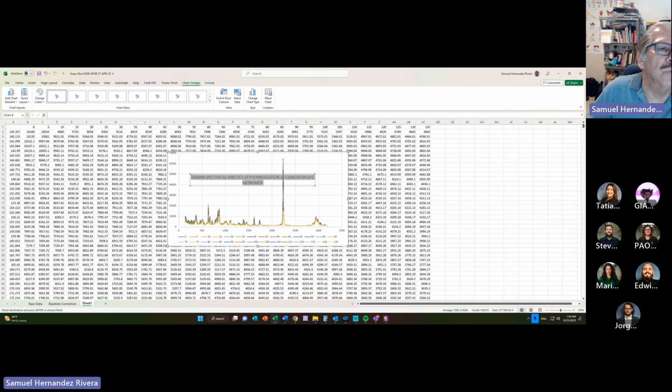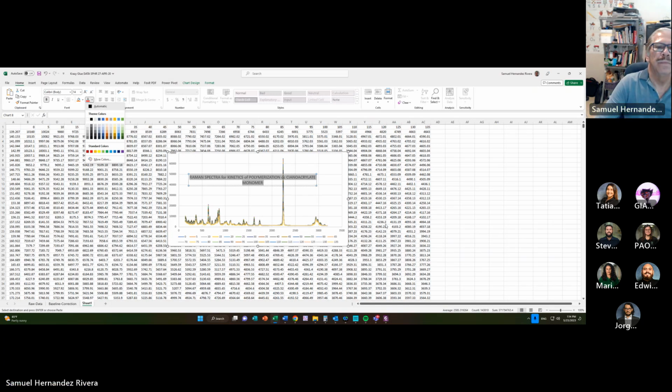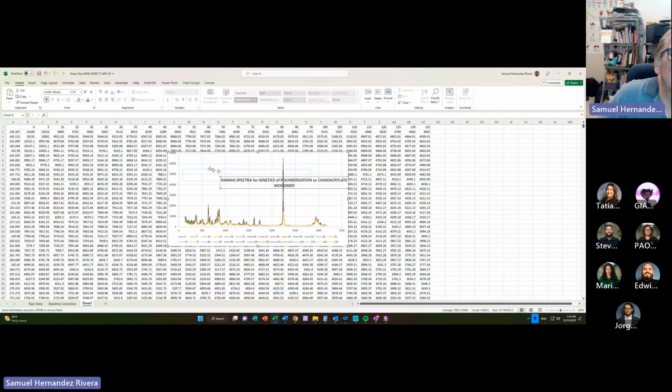The other thing I'm going to do is enhance the title. I will go back home and we put it in bold and we use a very dark hue. Well, that should have worked better. Let's see if I can fix it. Everything is a compromise.